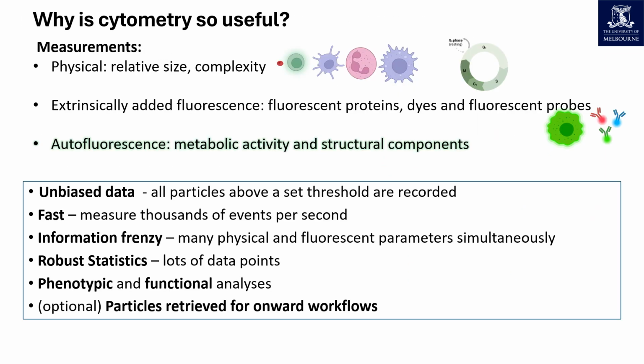As samples run through a cytometer, measurements are taken of each individual particle. When running cell samples, measurements include relative size and complexity. This information differentiates debris from cells, live cells from dead cells, the type of cell that it is, or if a particle is actually a clump of cells. It also measures emitted fluorescence, including the intensity of different fluorochromes that may have been added to the particles, and the intensity of autofluorescence or natural glow.